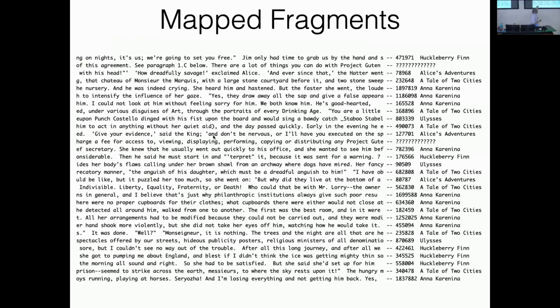But basically, we're going to be taking our sequences and searching in our database, and what we want to know is where in the genome they come from. You can think of the books here as basically a chromosome, and the position here as a position in the chromosome. Then we'll get to the next step in a minute. Everyone okay with that?